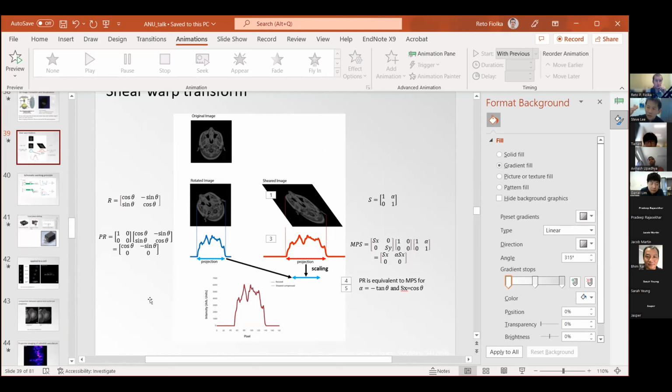So the galvo scanning, using a galvo to shear the image, that they're essentially not really linear. Yep. So the galvo is actually at some point, at some speed or some range, not fully linear. And how? So yes, that is a good question.